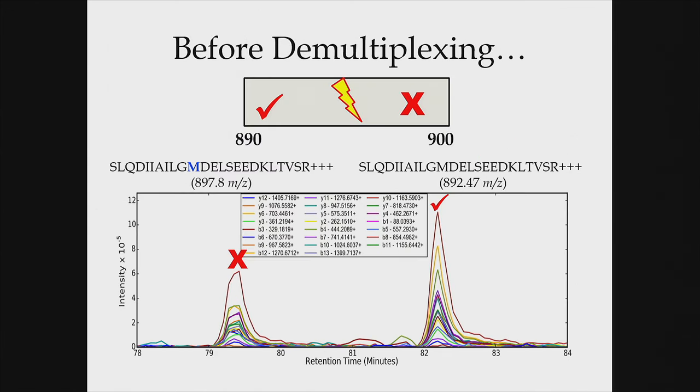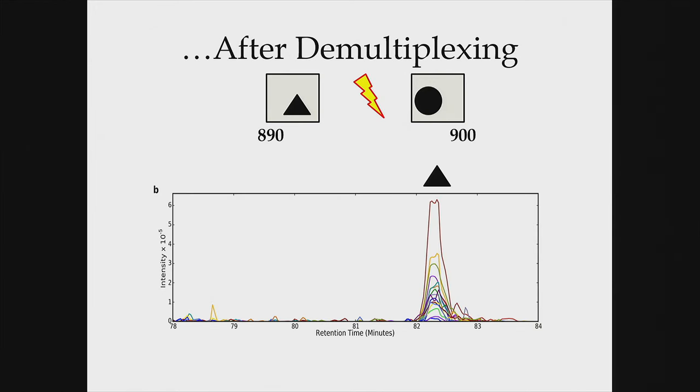And then I've always shown this example of the co-isolated peaks, the standard one and the one with oxidized methionine. When you use the multiplexing approach, you actually remove the bad peak, because we're able to resolve down to 4 mass-to-charge wide selectivity. So you've removed the interfering peak and probably made selecting peaks easier for you, because we no longer have the oxidized methionine being co-isolated.